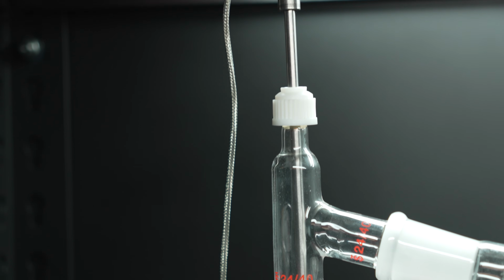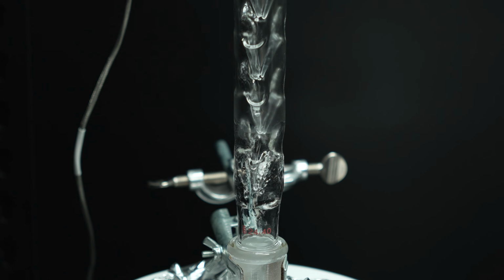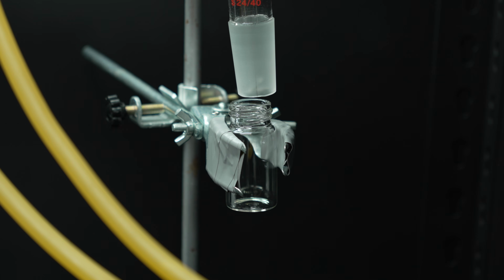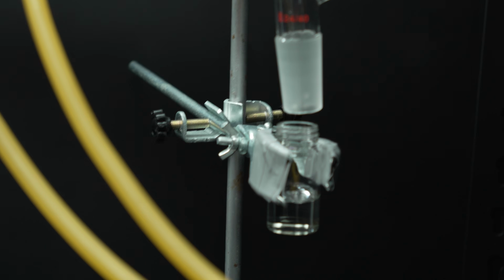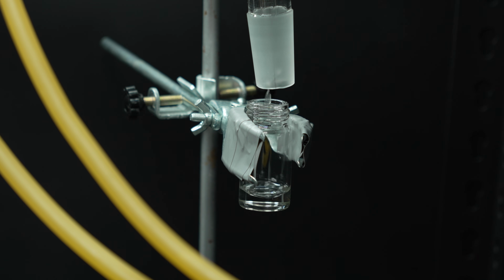I set up the distillation apparatus, and this time I put a proper thermocouple in the system, so I could better control the temperature. The first fraction came off at 141 degrees Celsius, which is below the boiling point of the acetate, so I think it's a mixture of isoamyl alcohol and our ester. After the temperature reached 142, I started collecting the second fraction and finally the third, and here I was a little disappointed. Everything around smelled like paint, but this time it was definitely the acetate.